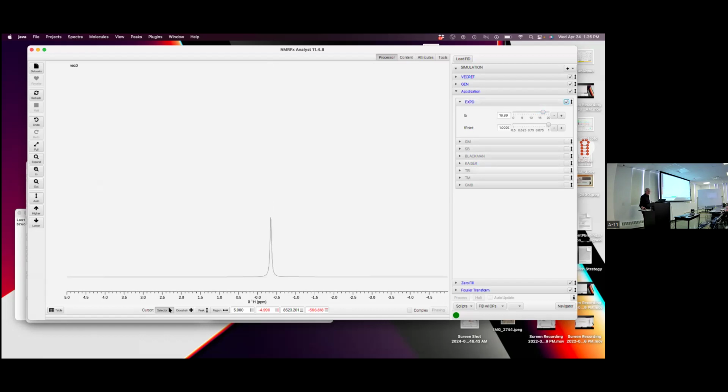You'll see that with the Kaiser window, I've gotten rid of those wiggles and have reduced the intensity less than I did with the exponential decay. The Kaiser has a sort of theoretical optimum that it maintains more intensity relative to getting rid of the sinc wiggles, as they're called, compared to many other apodization functions.